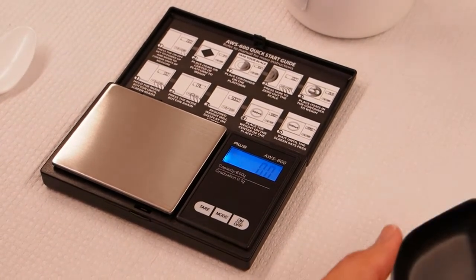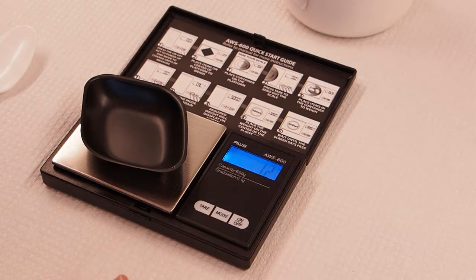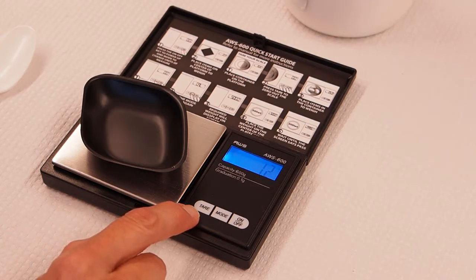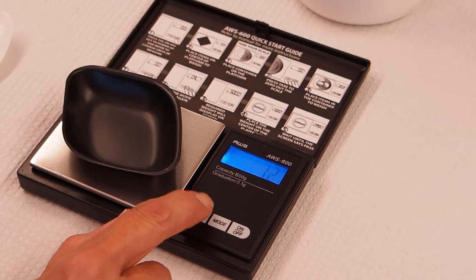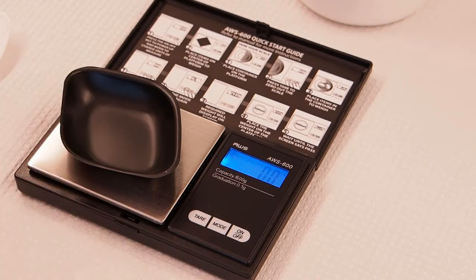Now we're going to put the weigh boat on and you'll notice that the weigh boat actually weighs something. It weighs 1.2 grams according to this scale. All we care about is the mass of the chemical we'll be weighing out and we want the scale to ignore the mass of the weigh boat. So we're going to push this button all the way on the left that says tare. What that does is it sets the scale's value to zero. So now any weight that it shows is going to be solely due to what we put into the weigh boat.